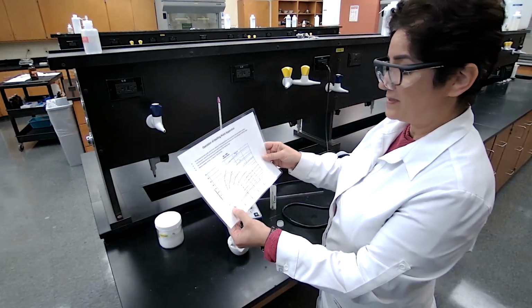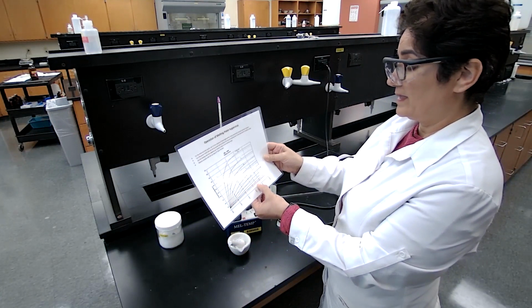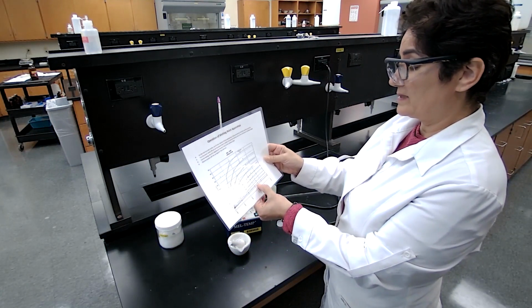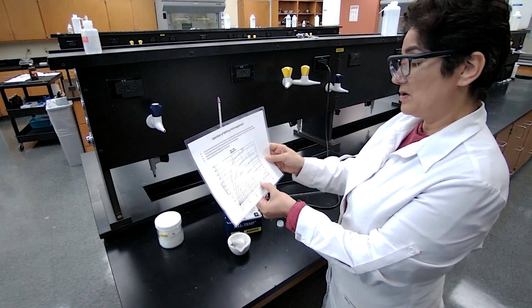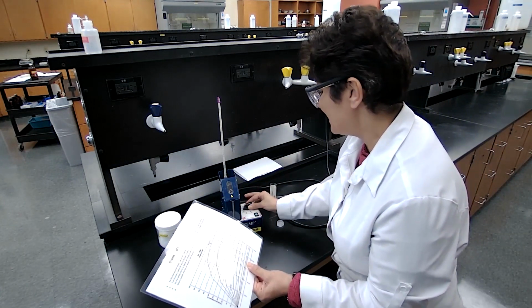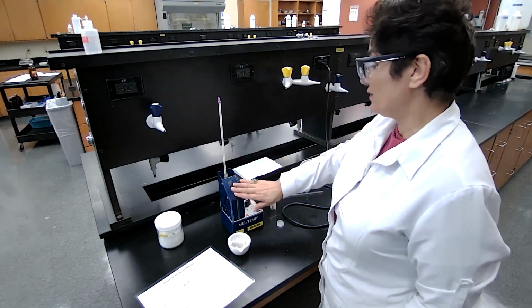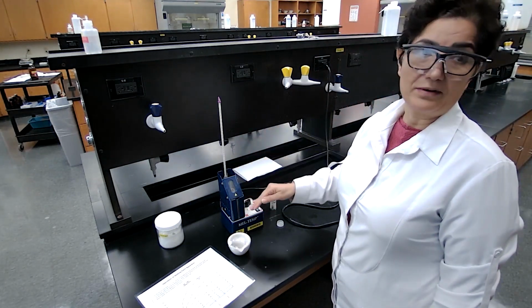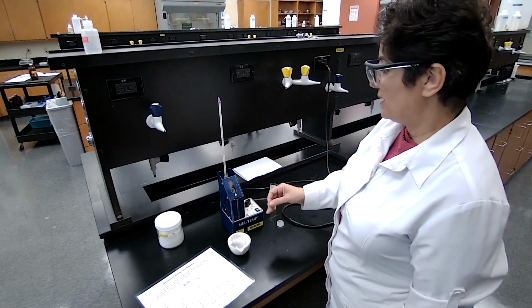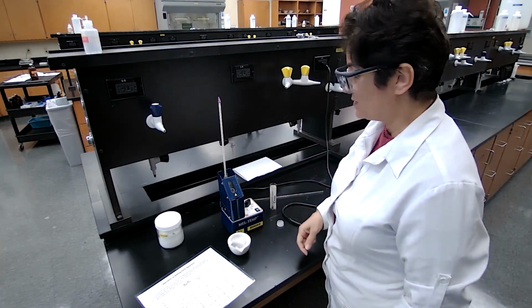If the melting point is around 45, the setting needs to be between 1 and 2, so I choose around 2, slightly less than 2. I'm going to have to wait for this to cool down to maybe 30 degrees, or a lower temperature, so I can start my new sample.